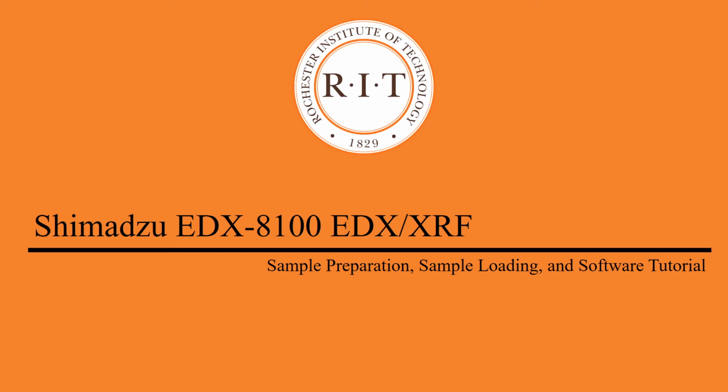Welcome back to the Rochester Institute of Technology, where today we will be discussing a sample preparation, sample loading, and software tutorial for the Shimadzu EDX-8100 EDX XRF system.